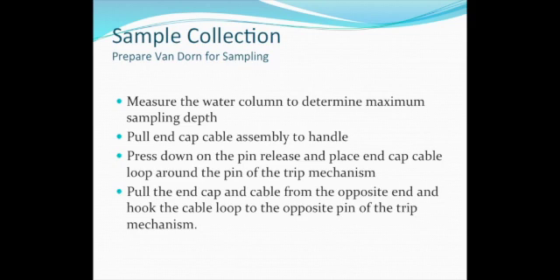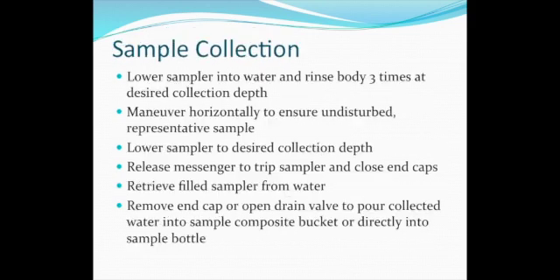Open an end cap and secure the cable assembly loop on the covered trip mechanism pen. Repeat to secure the other cable assembly loop on the uncovered pen. Using the marked increments on the sampling line, the bottle is slowly lowered to rinse at the sampling depth three times.